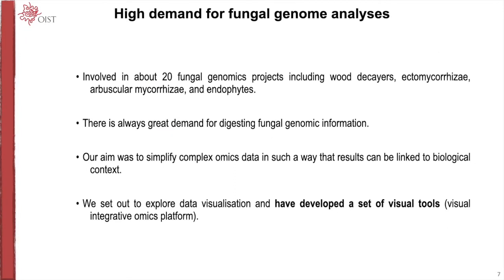Okay, let me talk about the background of my research projects. I've been involved in about 20 fungal genomics projects, including wood decayers, ectomycorrhizae, arbuscular mycorrhizae, and endophytes. There is always great demand for digesting fungal genomics information. And our aim was to simplify complex omics data in such a way that results can be linked to biological context. So we set out to explore data visualization, and we have developed a set of visual tools. We call it Visual Integrative Omics Platform.